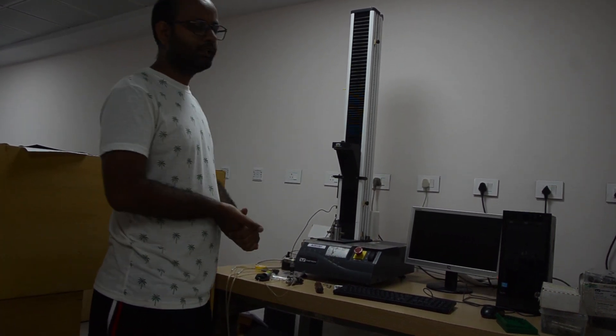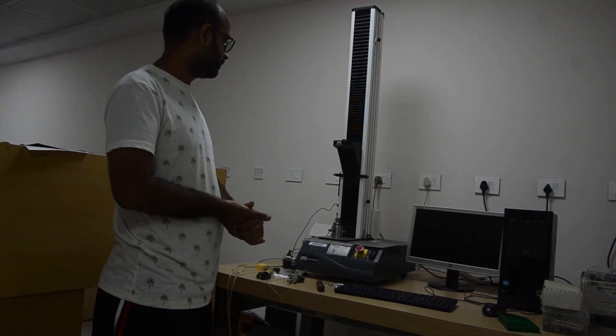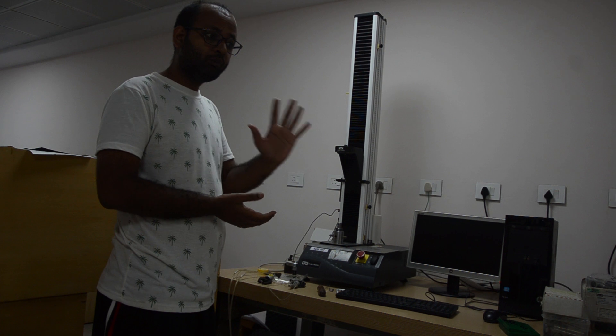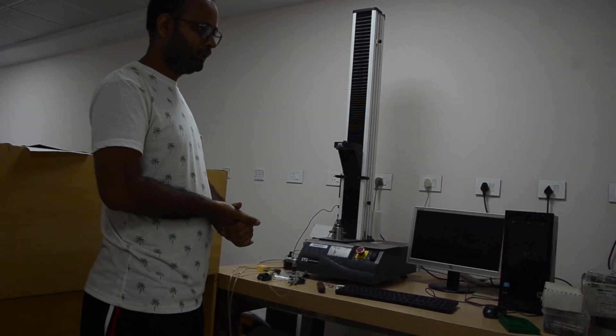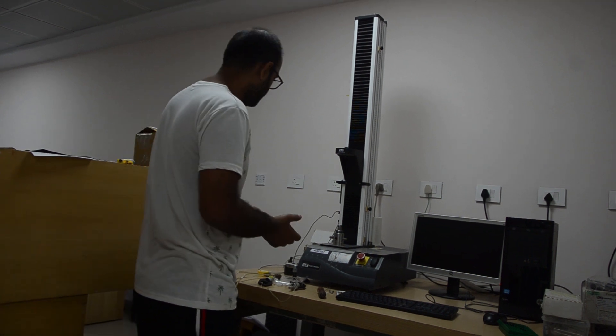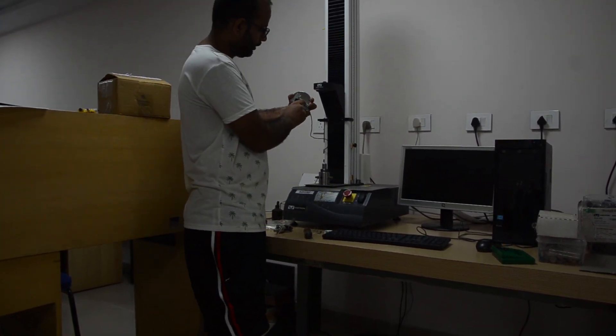Its maximum load carrying capacity is 5 kilo Newton. We also have a 100 Newton load cell and a 5 Newton load cell. The 5 Newton load cell is what we are using for single fiber tensile testing.